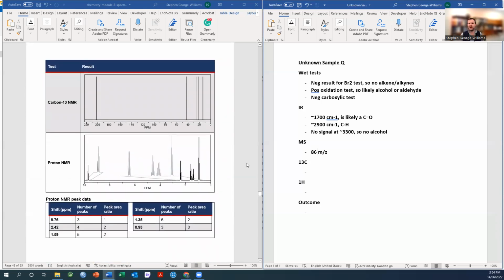So we're going to go into our NMR data to really pull out what I'm looking at here. Firstly, I look at the carbon environments, I can see there's 5. At which point I'm immediately thinking, well, how can I have 5 carbons in a non-symmetrical system so that I can see all 5 of them?